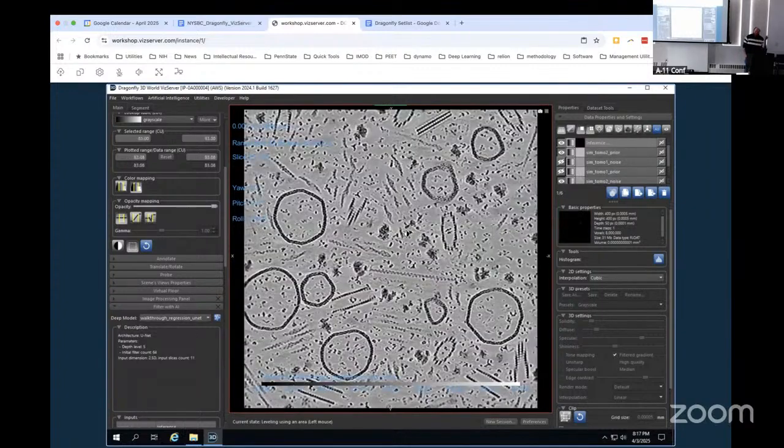You can drag this and it'll show. It only does that when I denoise synthetic data for some reason. I don't know why. Sorry, what did you click? This is the area contrasting tool. Okay. And I just dragged it over this and let go. I don't know if that makes sense, but if it's not working, I'll come and show you how to do it. It almost just looks like a display bar, right? It just says that it's white.